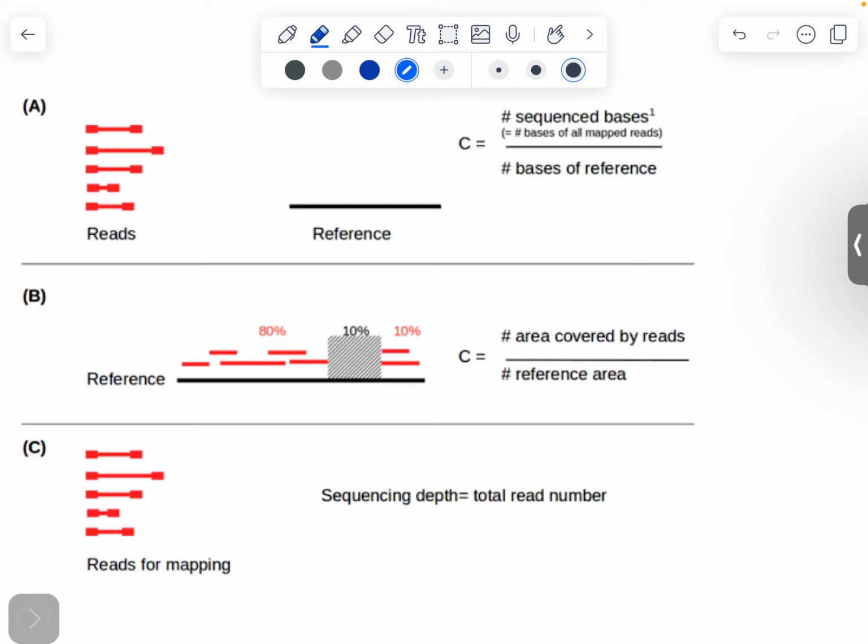So there is a lot of confusion and problems in mapping these reads to the reference genome. That's why we find some regions without coverage. Those reads are eliminated by the software because they cannot be mapped to a particular place. That's why we find some areas with low coverage, or some areas without coverage.